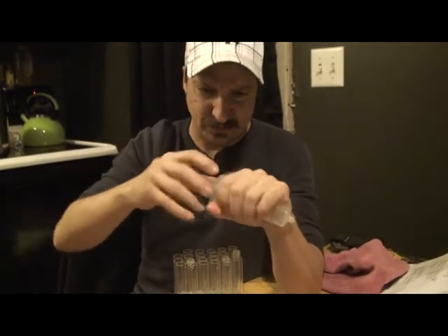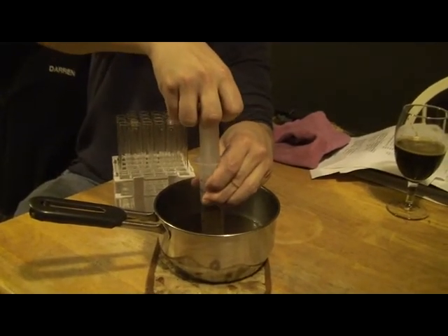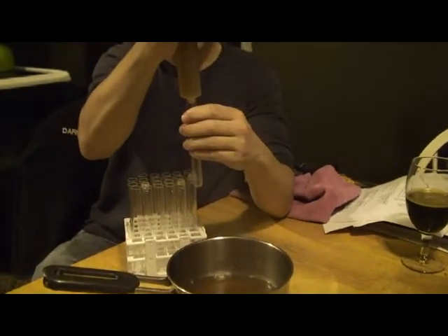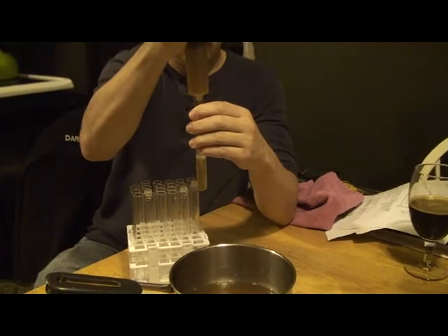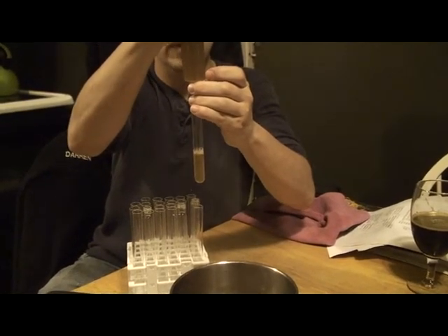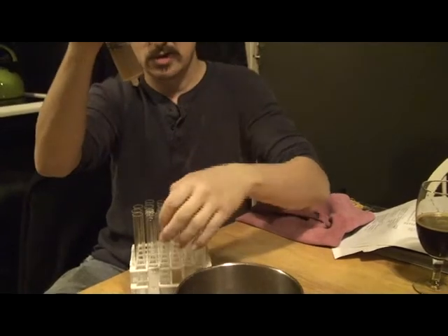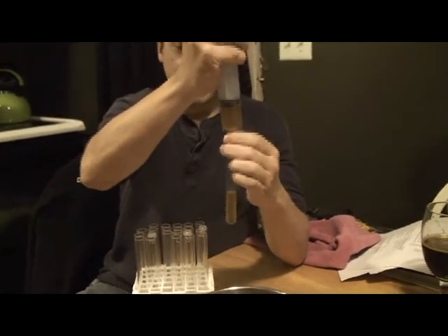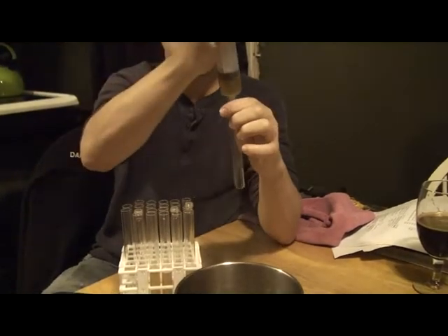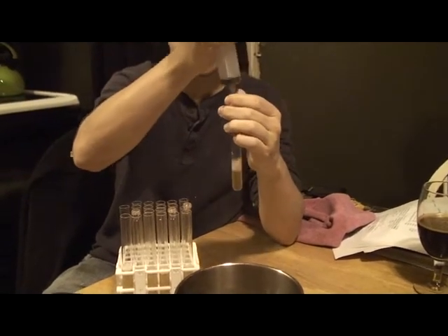Everything's been cleaned and sanitized. Now I'm going to take some of our solution that we made earlier — it's still piping hot — pull it up into the syringe, and I'm going to fill these up approximately a third of the way. It's looking more like 15 milliliters per tube. The first time we did this, we used a funnel in the pan — do not want to do it that way, absolutely painful. This is the way to go.